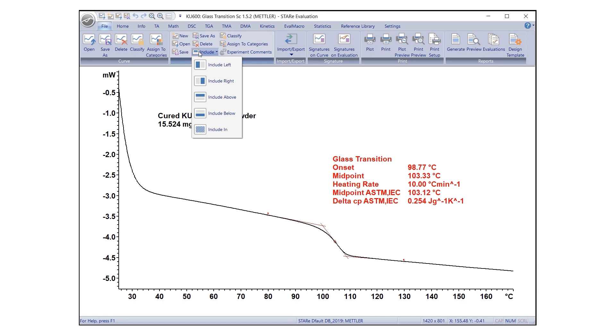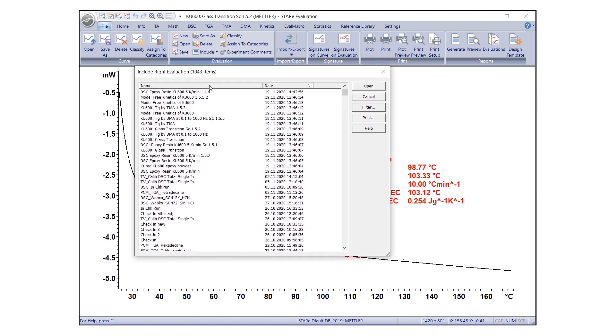For example, left, right, above, or below. After selecting the position, a dialog box opens with a list of evaluations stored in the database. Select the desired evaluation to be displayed in the specified position and click Open.